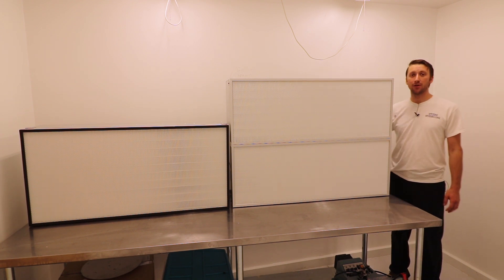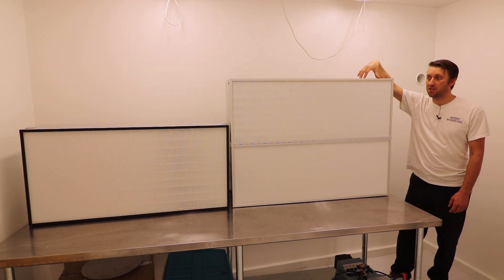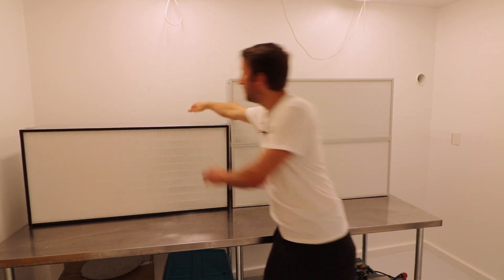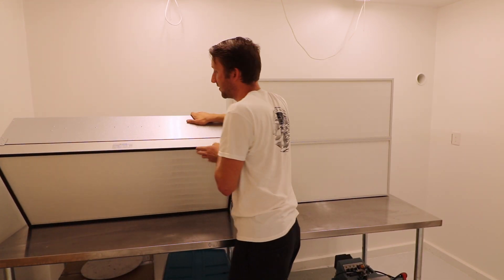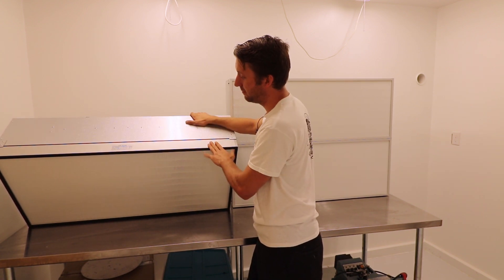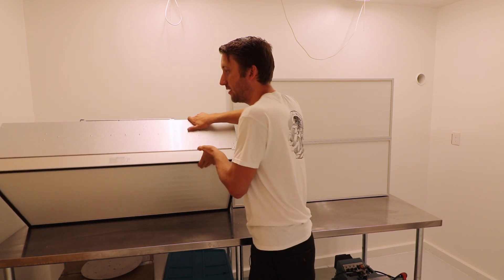These have pre-filters, a three-speed motor, and then they have the primary filter, which is easily changed out. The primary filter is changeable too, which is not always the case. Some fan filter units are molded in place with the main filter. This one you can easily unscrew and change out the filter.